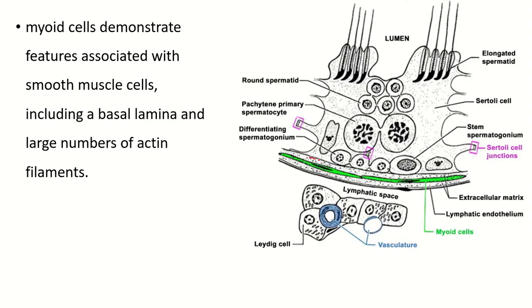This outermost layer of the seminiferous tubule is known as the tunica propria, which contains myoid cells. The myoid cells are smooth muscle-like cells which contain actin filaments, so they are able to contract. This helps the movement of the spermatogenic cells through the lumen of the seminiferous tubule.